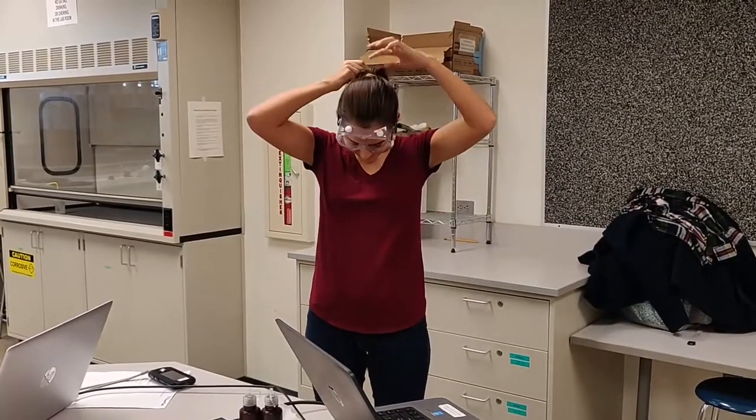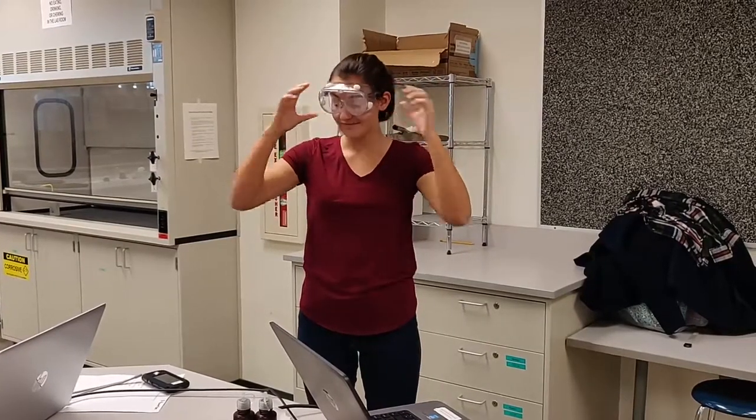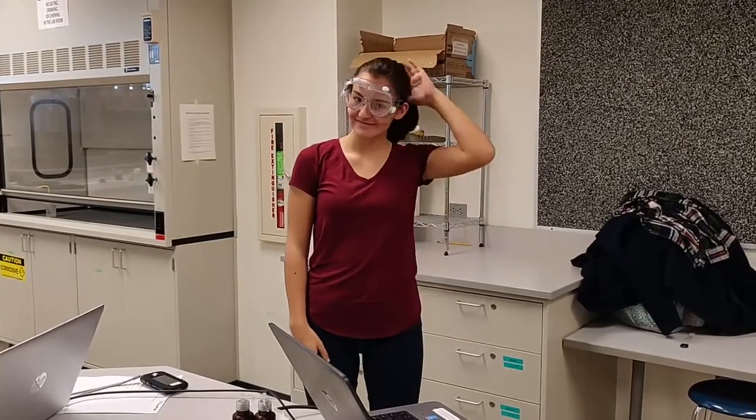When operating a Bunsen burner, safety goggles should be worn at all times, and long hair should be pulled back into a bun or ponytail.